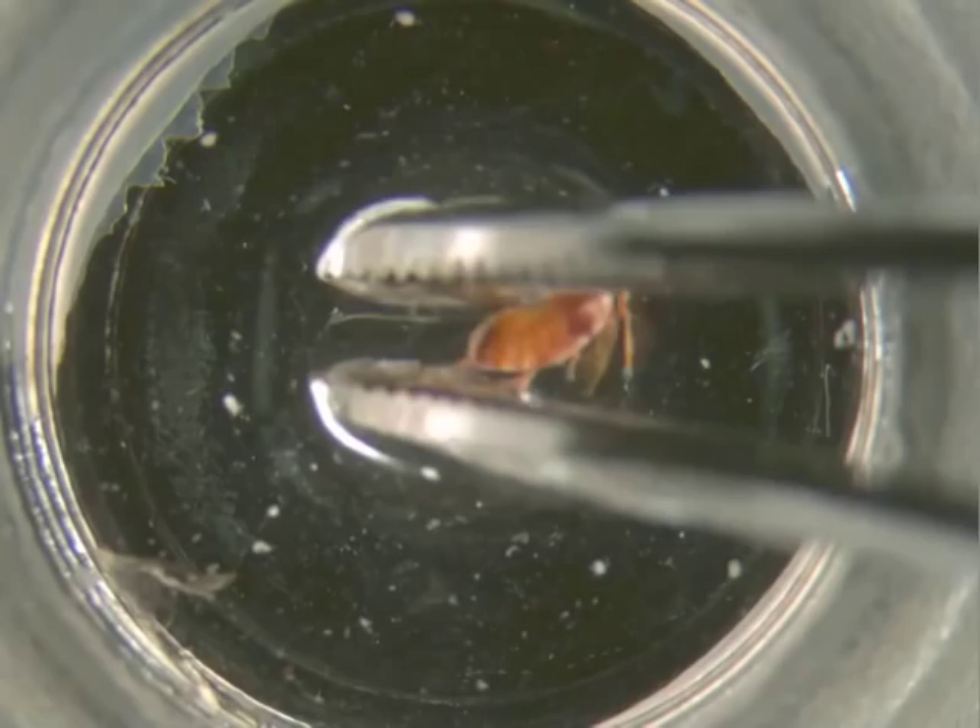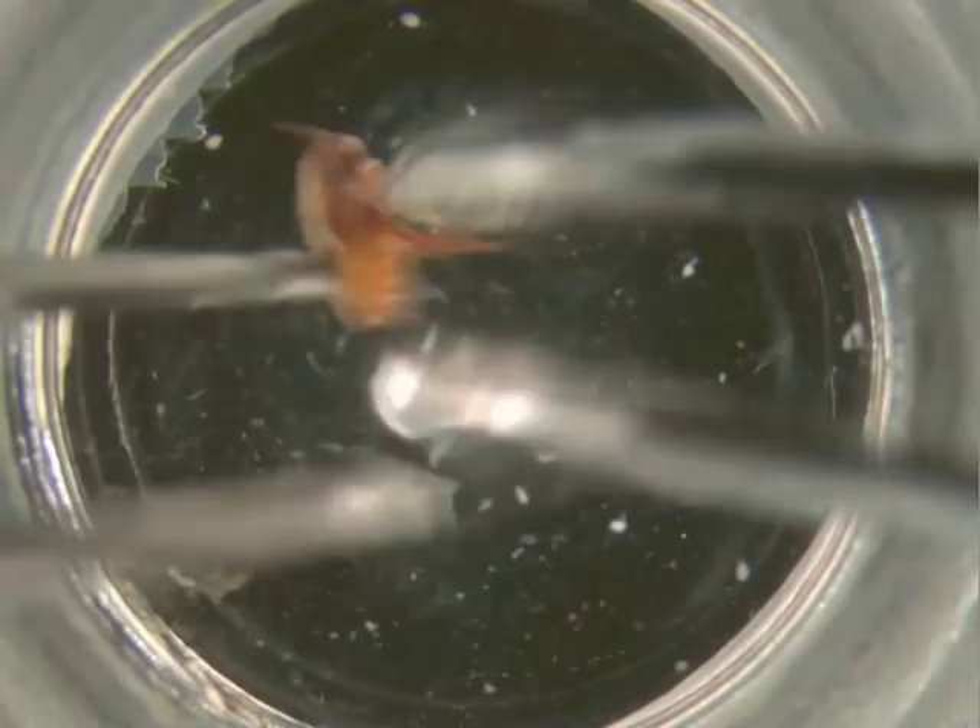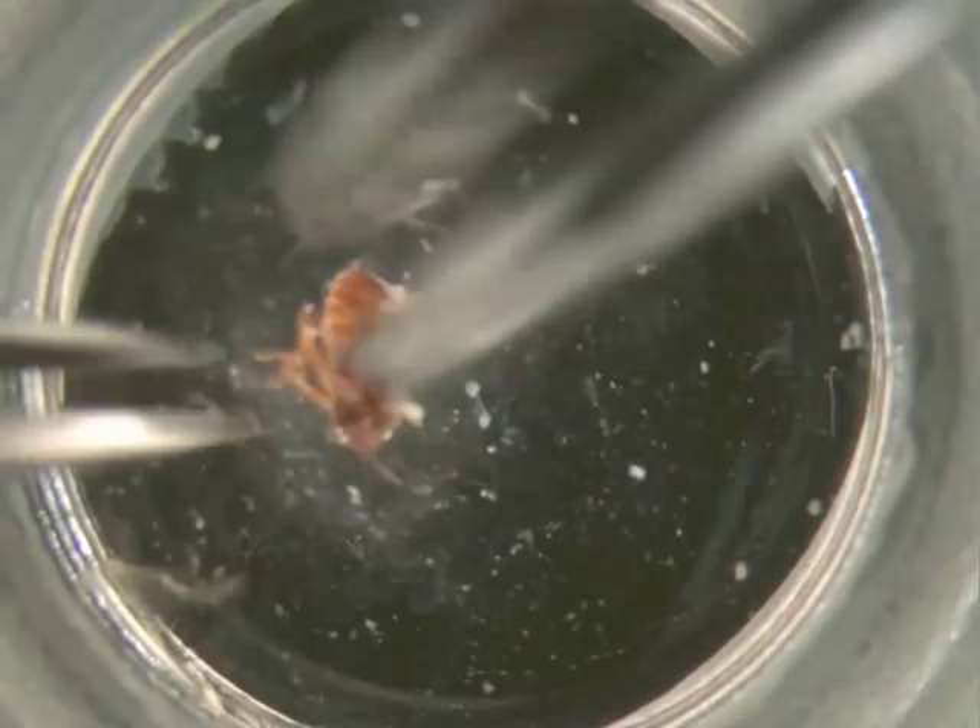You want to try to get the beetle onto its back and then pull the abdomen away from the head and thorax. The abdomen is what contains the ovaries.